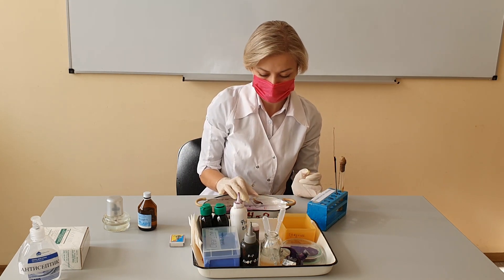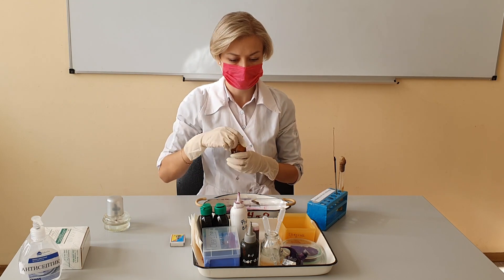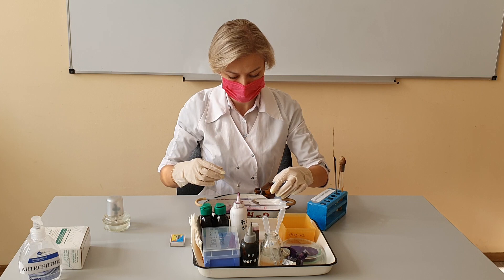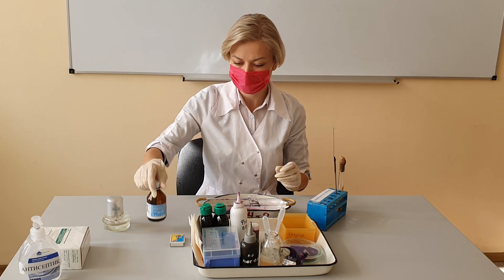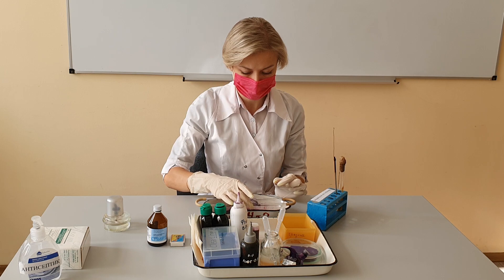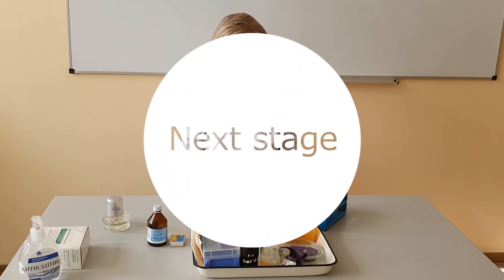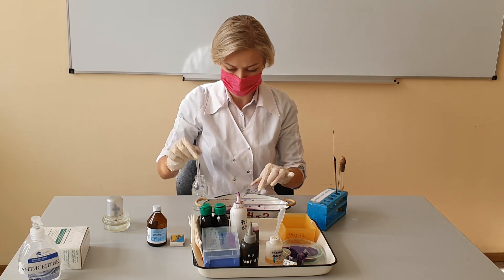The next step involves addition of the decolorizer. This step is somewhat subjective because using too much decolorizer could result in a false gram-negative result. Likewise, not using enough decolorizer may yield a false gram-positive result. Next, rinse with water for 5 seconds.